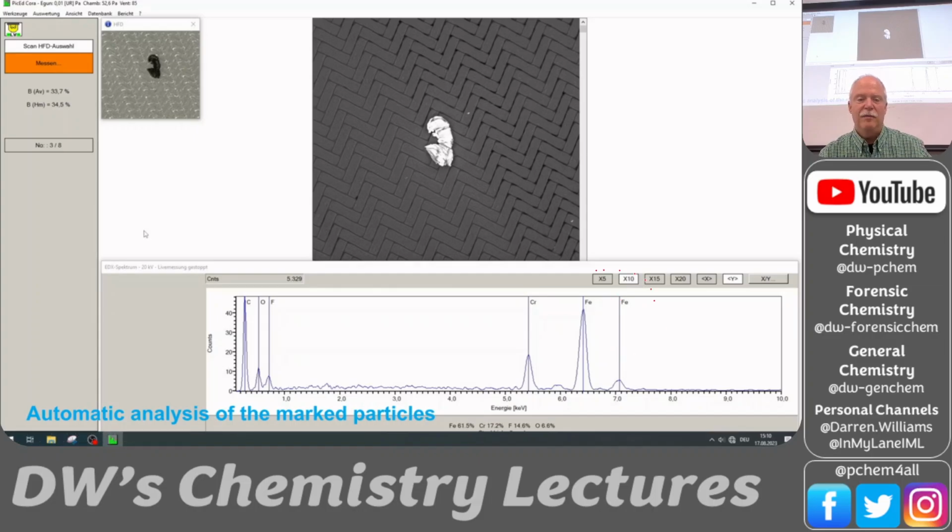This is the energy dispersive spectrum of that particle. So they blast it with electrons and they look at the X-rays that come off and they see an X-ray for chromium and 2 for iron. And again, you have the carbon here, the oxygen, the fluorine. Carbon's everywhere, so you really can't say much about it from that, but you definitely see carbon. What do you know about this particle if you see iron and chromium?